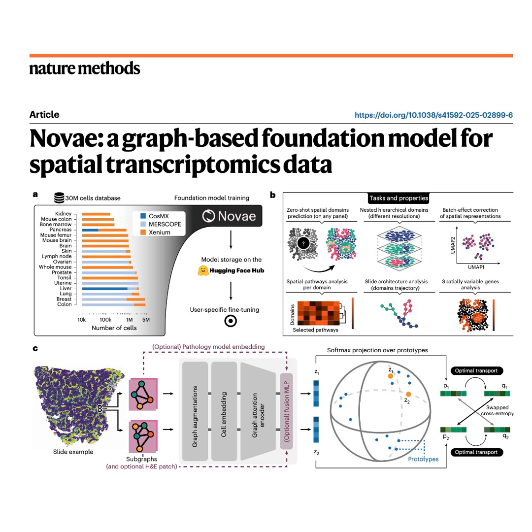And that location, that context, is king, isn't it? It absolutely is. I mean, biology is fundamentally spatial. Cells communicate based on who their neighbors are. And by defining these localized areas, we can identify what are called spatial domains. Think of them as specialized microenvironments or niches, like the germinal centers in a lymph node or the regions right next to a tumor. To really understand disease, you have to know the address book.